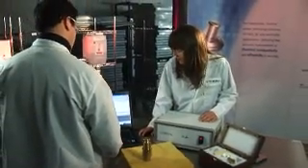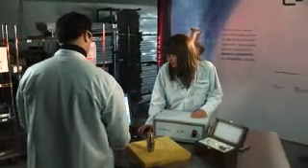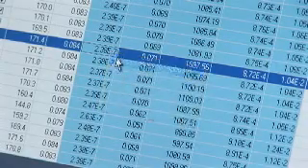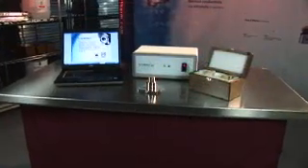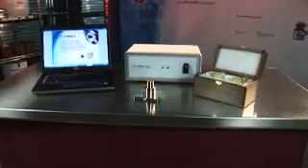Lab managers can turn around sample data in seconds without the need for onerous sample preparation, and data is fully exportable with the click of a mouse button. Many of our clients integrate the technology within their own manufacturing environment for real-time quality control. The technology has even been incorporated into process equipment for real-time monitoring of powder blending and various other applications in manufacturing.